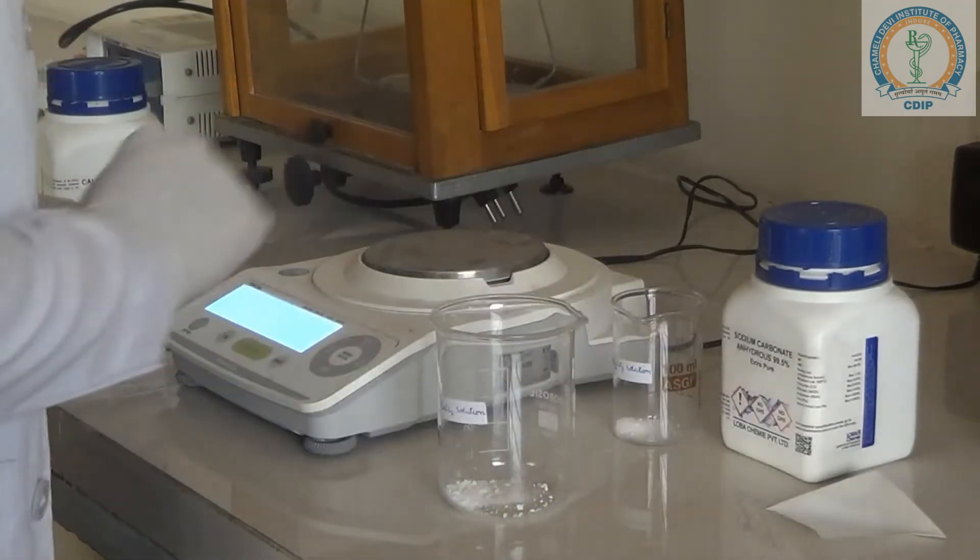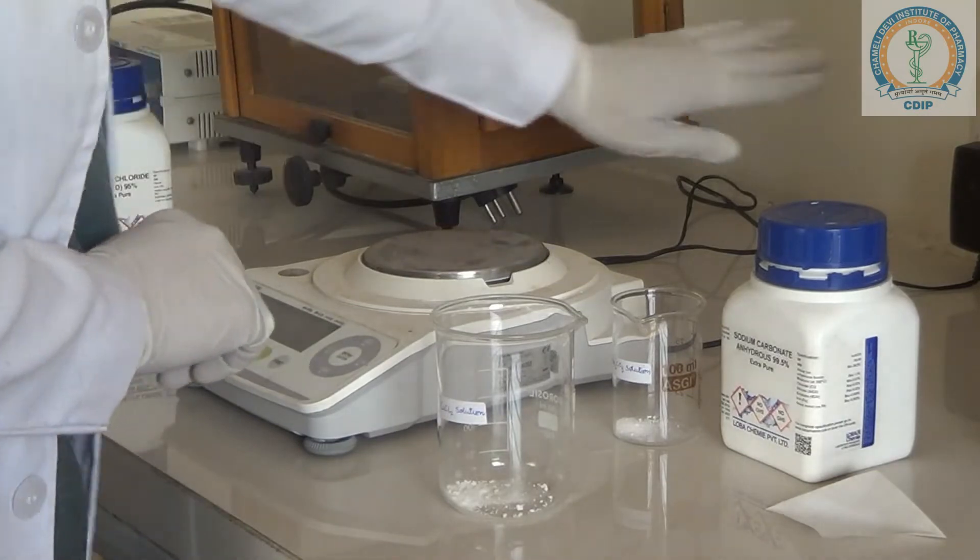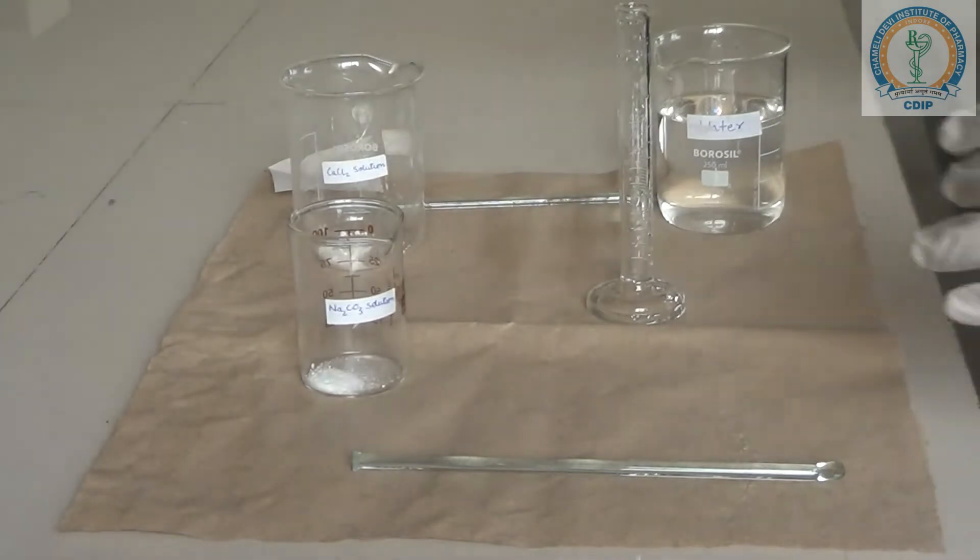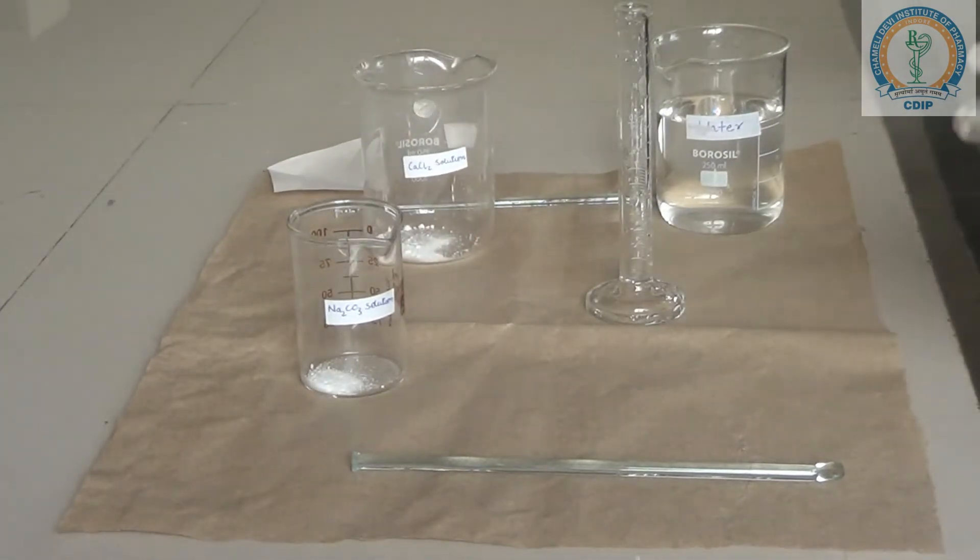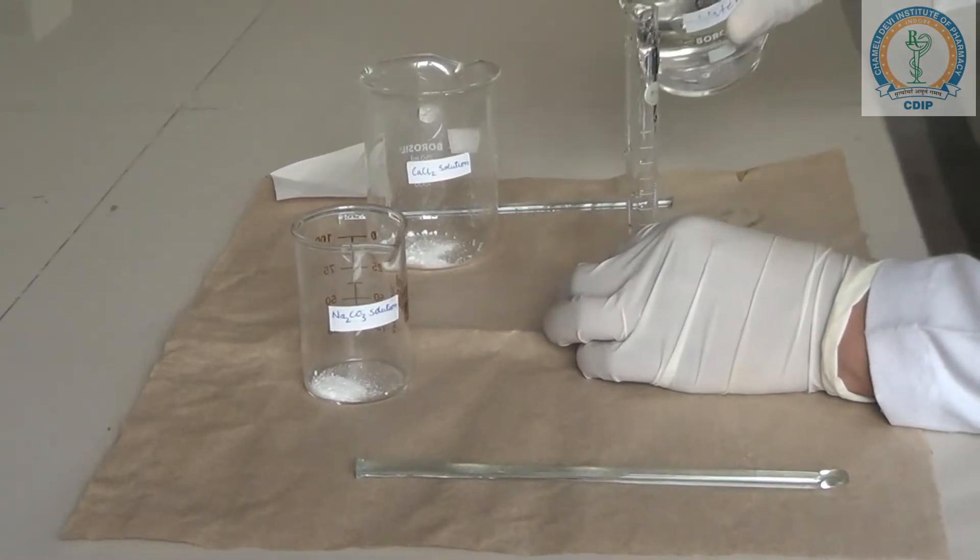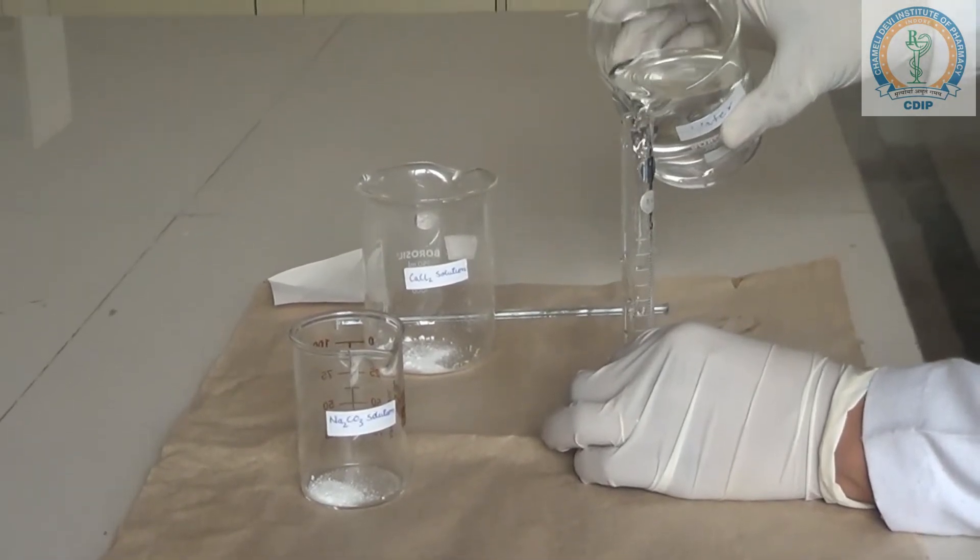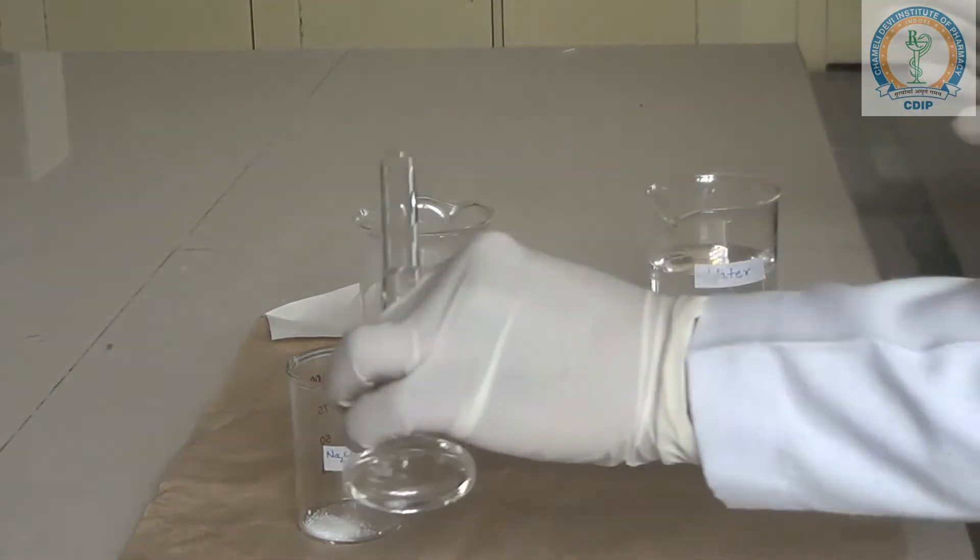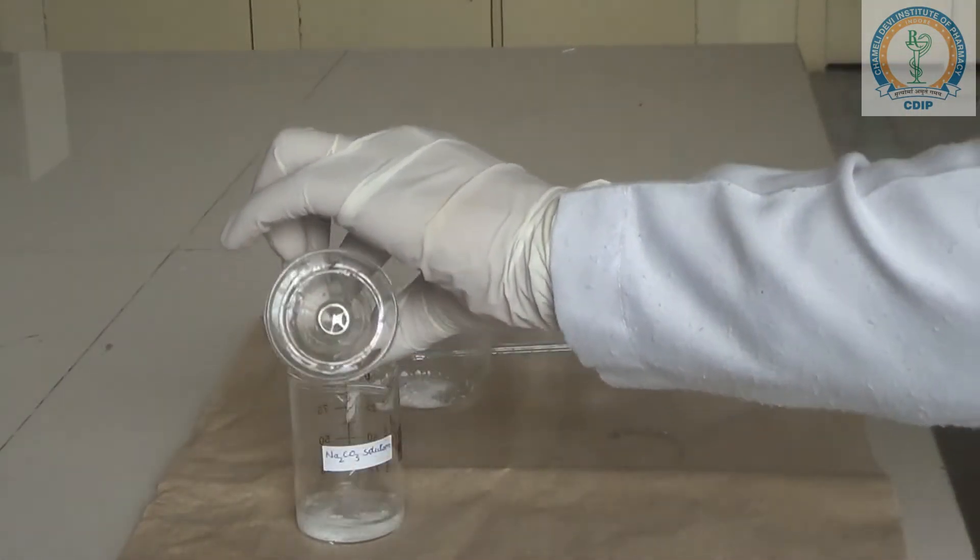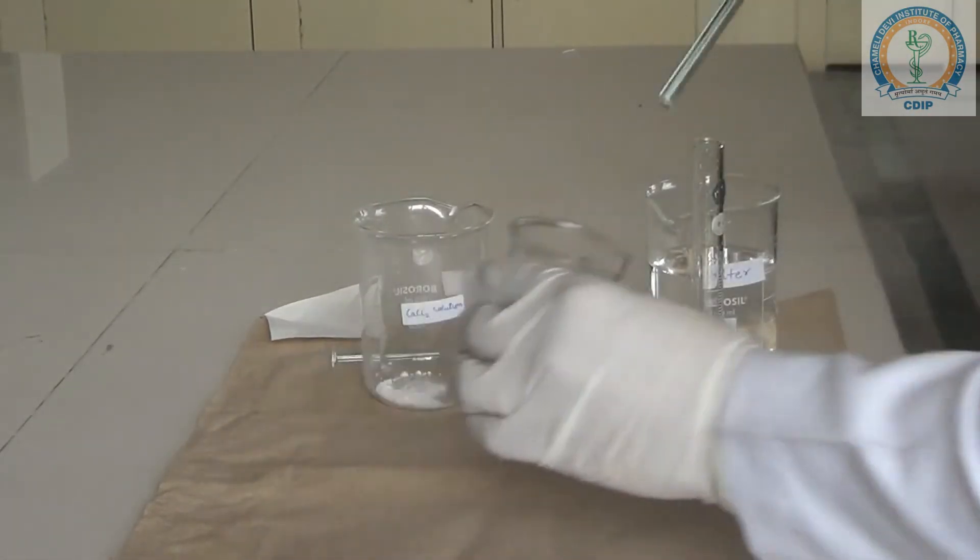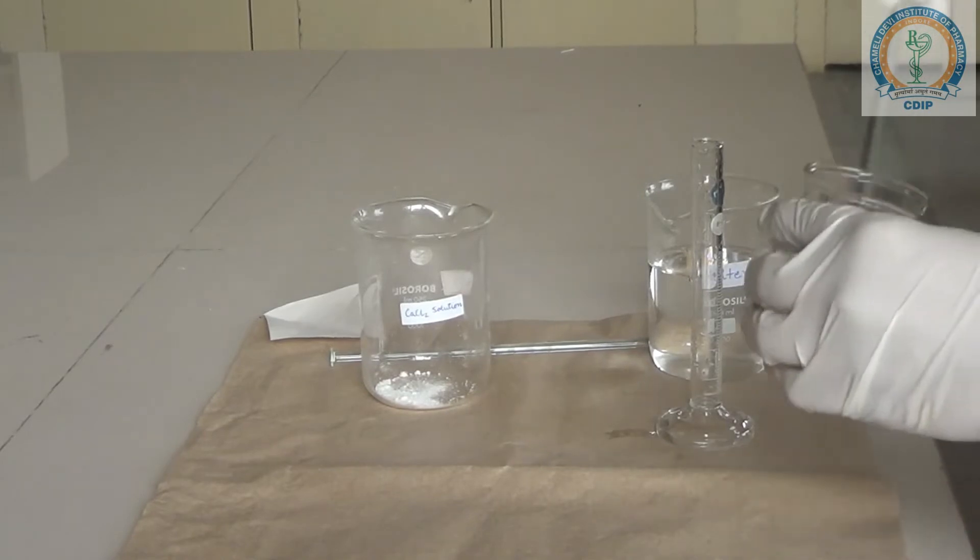We will prepare the solutions separately, both solutions. Now, after weighing this sodium carbonate and calcium chloride, we are going to make the solution of both these substances in water. So we are taking distilled water here, up to 10 ml, and transferring it into sodium carbonate solution and mixing it well, dissolving this inside water.